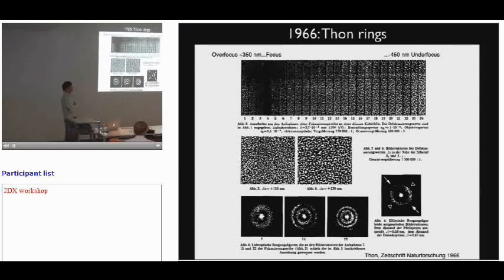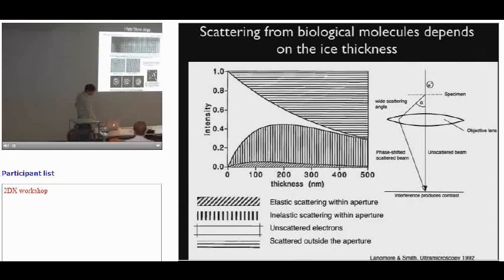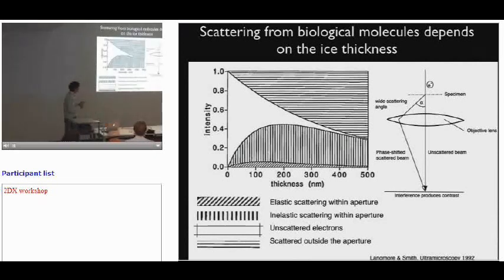What does scattered outside the aperture mean? Is it multiple scattering, or how do these electrons get there? In the previous slide. So outside the aperture, I guess that just means that these are not being captured by the lenses, right? I mean, at very high angles. What happened to these in the sample?